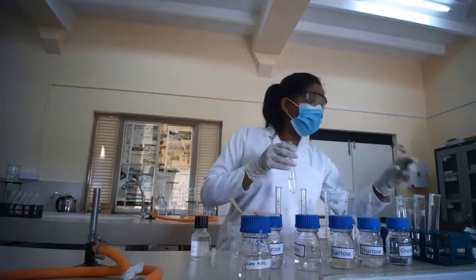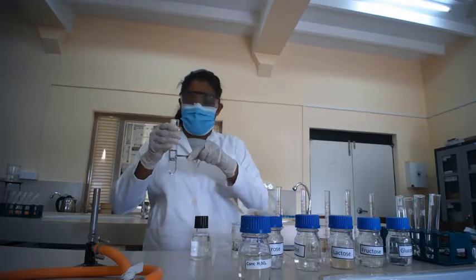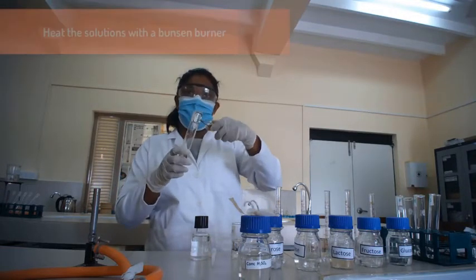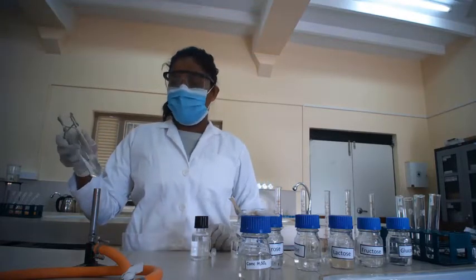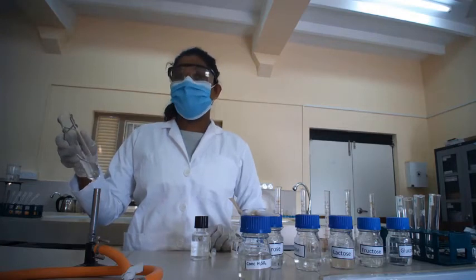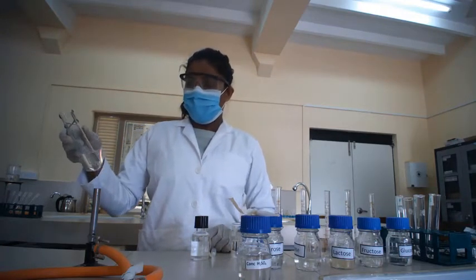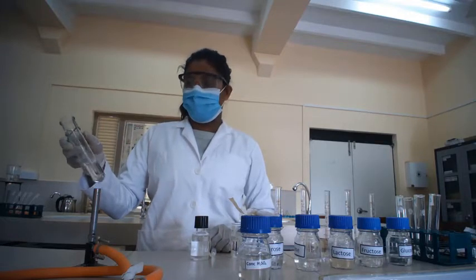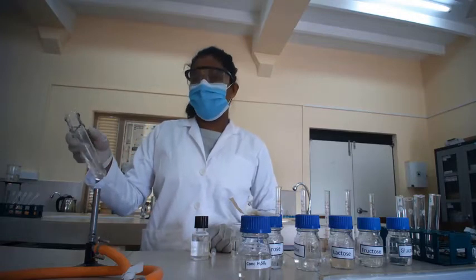Then you have to boil this in a Bunsen burner. In boiling, make sure that you are not going to boil it for a continuous period. Otherwise, it will make some explosions. And while boiling, you have to observe the color change.